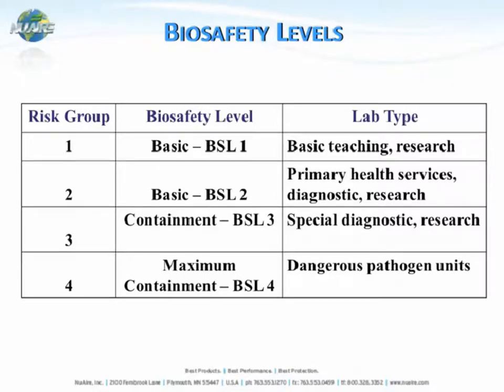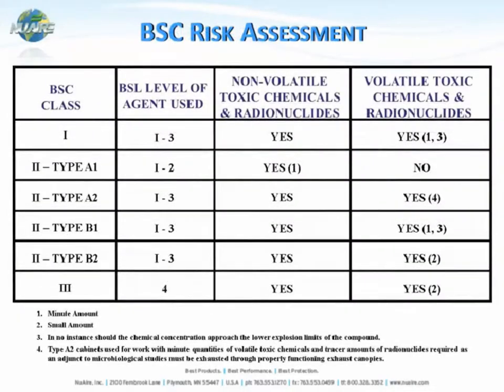Risk group 4 falls into BSL level 4, appropriate for dangerous and exotic agents that pose a high individual risk of life-threatening disease. The different BSC classes also have alignment with BSL level agents used, including non-volatile toxic chemicals, volatile toxic chemicals, and radionuclides, listed by whether they can be used in minute or small amounts depending on the type and classification of the biological safety cabinet.